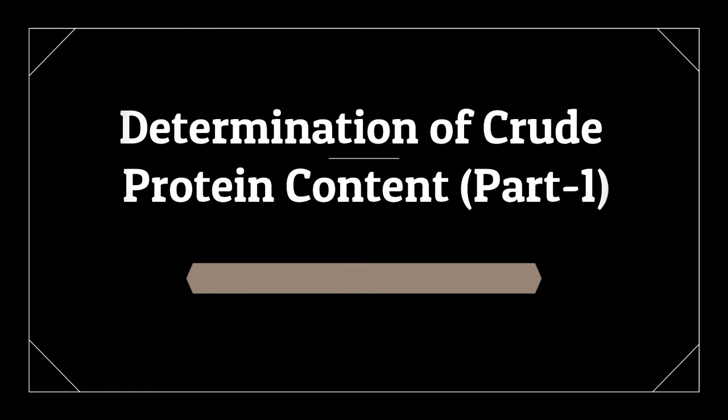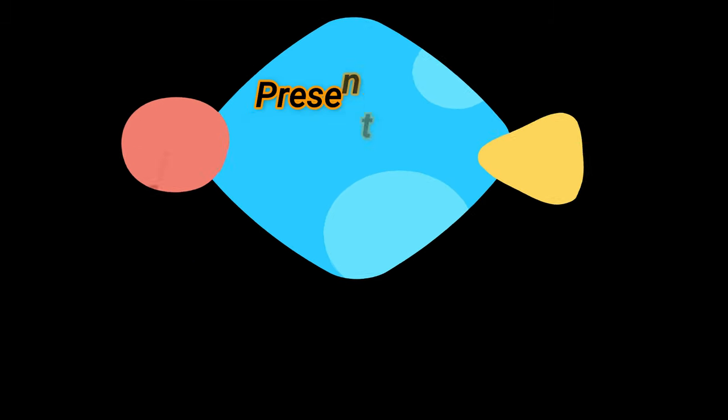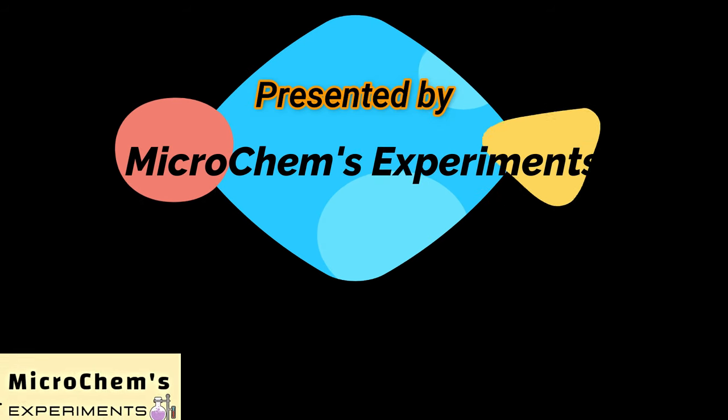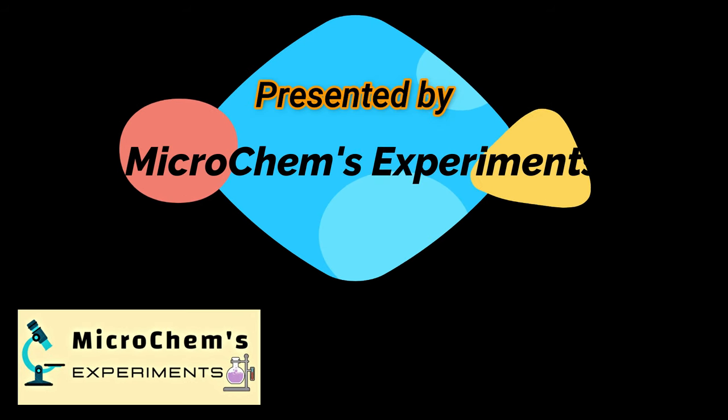Determination of protein content is a common proximate test. This parameter is very important for the analysis of food and feed samples. This video represents the procedure of protein analysis by the Kjeldahl method. Welcome to the channel Microchemist Experiments. Be with us, be a laboratory expert.